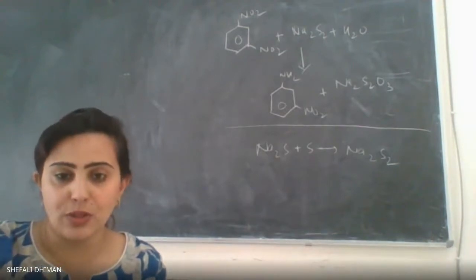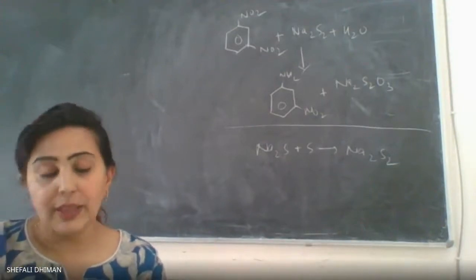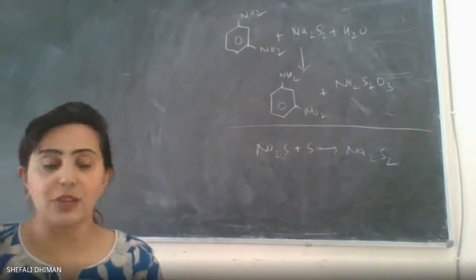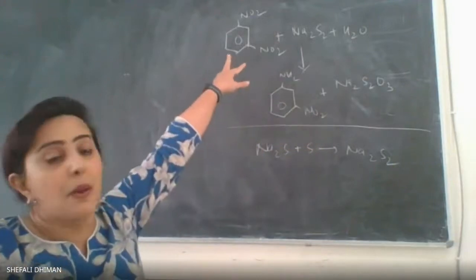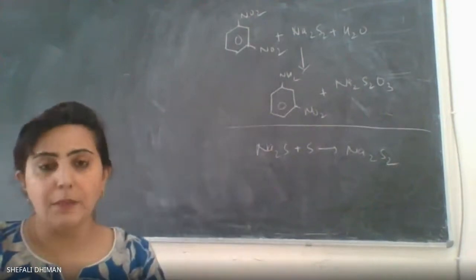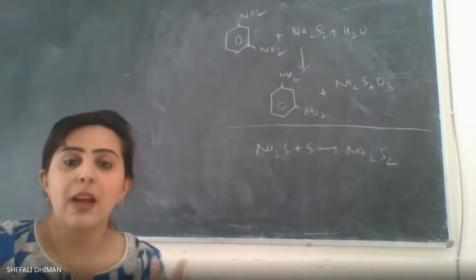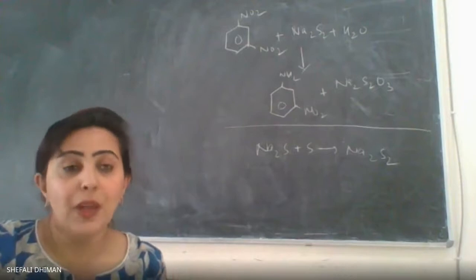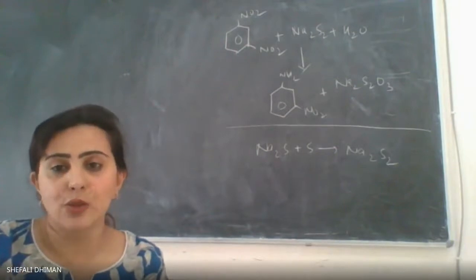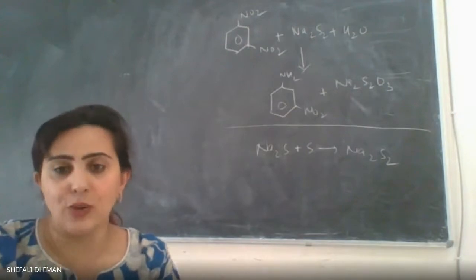The sulfur does not dissolve easily, so it will take a while. After some time, a clear solution will form — that indicates the reducing agent has been prepared. Once ready, take your reactant, metadinitrobenzene, approximately five grams, dissolve it in water, and heat it to boiling. Metadinitrobenzene does not dissolve fully, but maximize dissolution in water by continuing to heat.